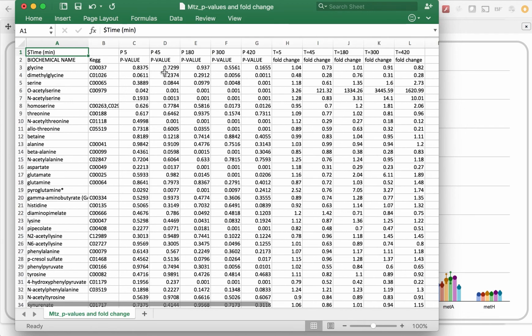Traditionally, such p-values have been used to dismiss results deemed not statistically significant, or to identify candidates with significant changes in order to conduct an enrichment or other analysis. The dashboard will not omit any results unless the user chooses to exclude them from the uploaded file, but it can use the p-values to show the result of an enrichment analysis.